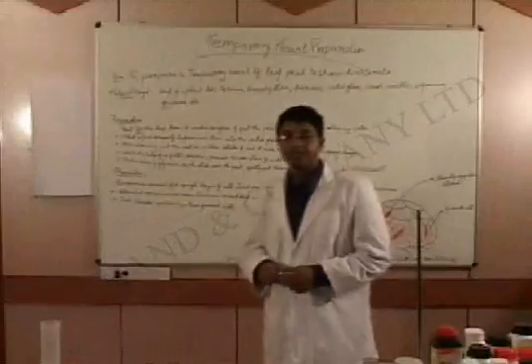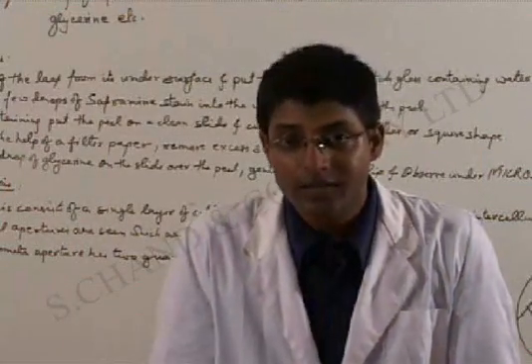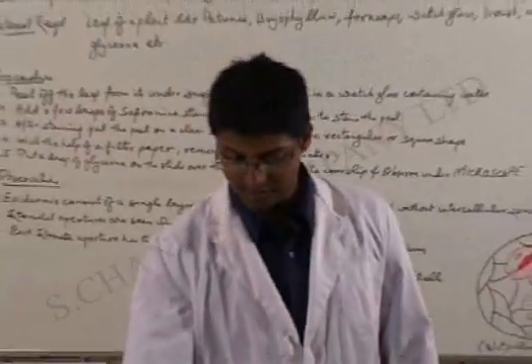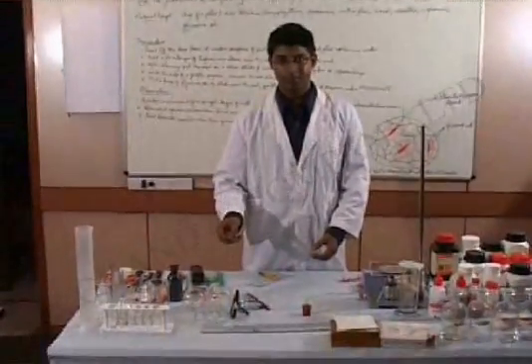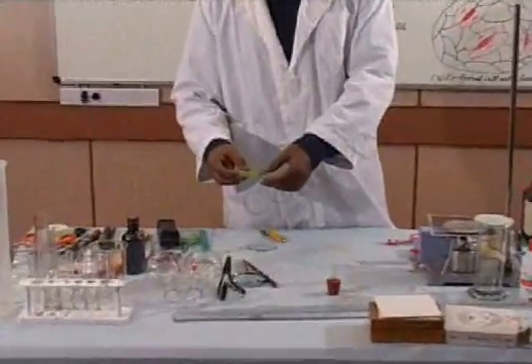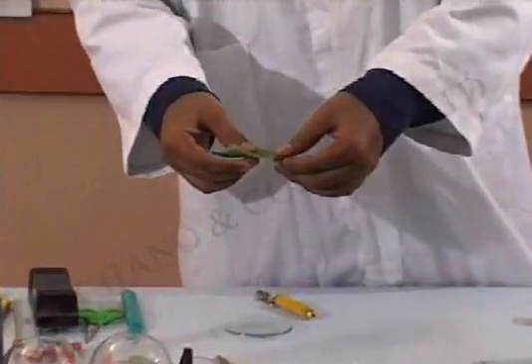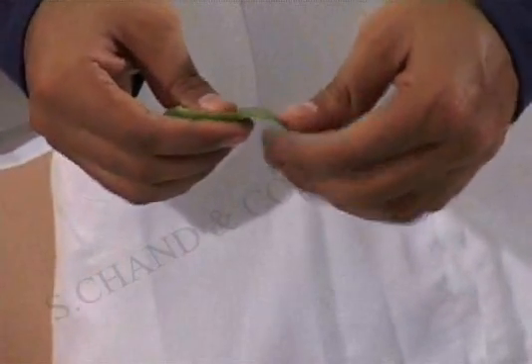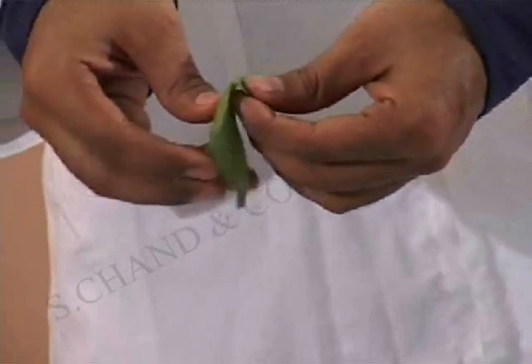Now this is the experiment that we are going to do. So students, we start the experiment now. As you can see, I have a leaf here. Now I will be making a slide of this leaf. Hold the leaf and bend it inwards and peel it very slowly.